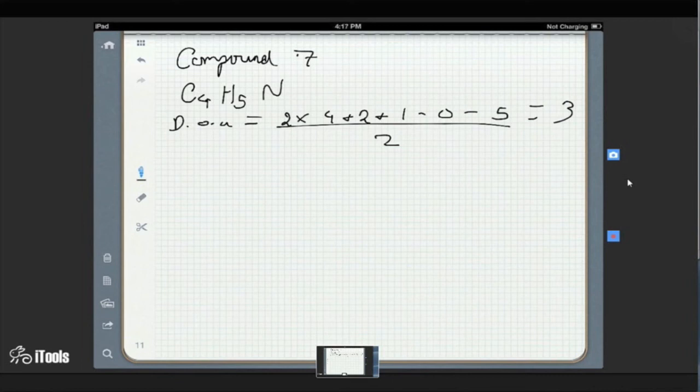Do we see that peak? It says impurity, but yeah. No, look here. For an imine, we get a peak at about 1660, and we have a peak at 1645. Yeah, okay. Oh no, I think that's an imine because it says conjugation lowers frequency. So the C=C is around 1600, and this is just a little bit stronger than C=C. So we have an imine at 1645. So that deals with 1 degree of unsaturation there.